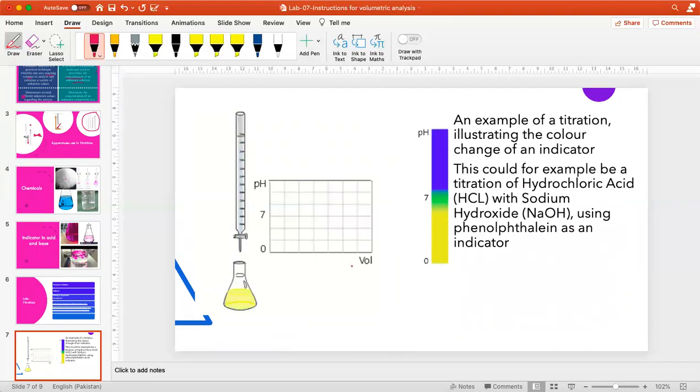तो ये pH है और ये volume है, right? और ये जो आपको part दिया है यहाँ पे, this is the different colors which actually pH represents. तो 0 पे yellow है, 7 पे green है और more basic पे जाके blue है. So ये 0 से 7 पे आके आप देखेंगे कि कैसे pH इसका increase कर रहे हैं.